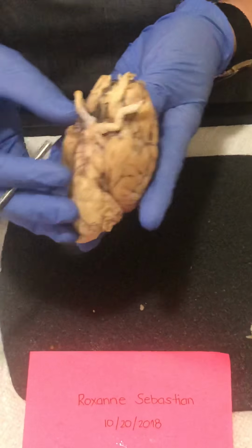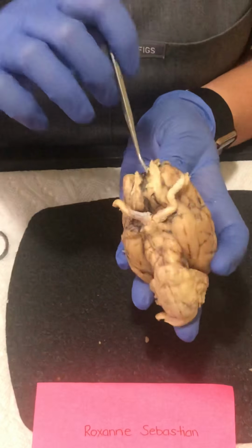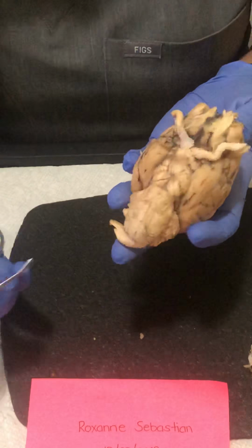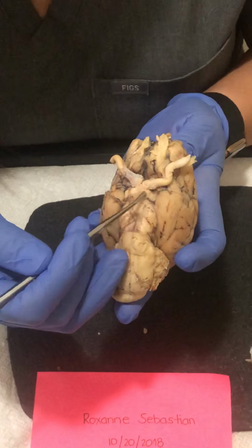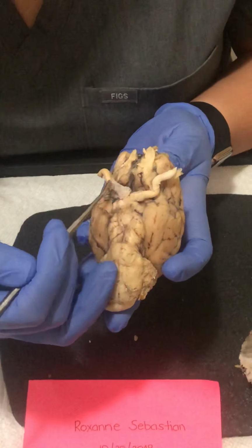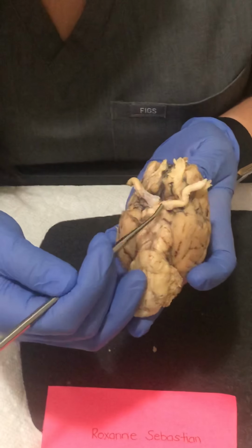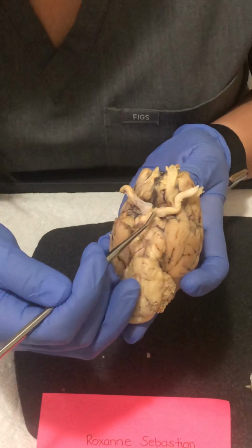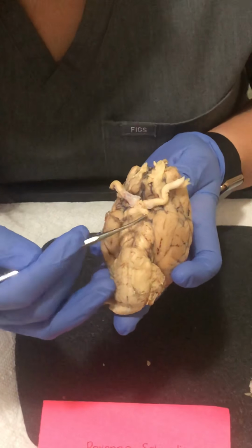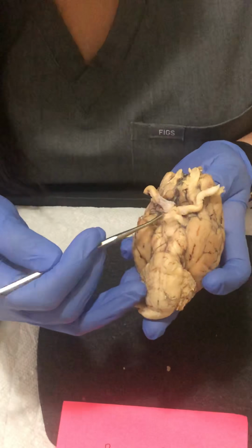Now we're going to move to the ventral view of the sheep's brain. This part right here is your olfactory bulb. And right here, as you can see, is an X. The top of the X is your optic nerves, and the middle part where the X meets is the optic chiasma. And then the bottom part of the X is your optic tracts.